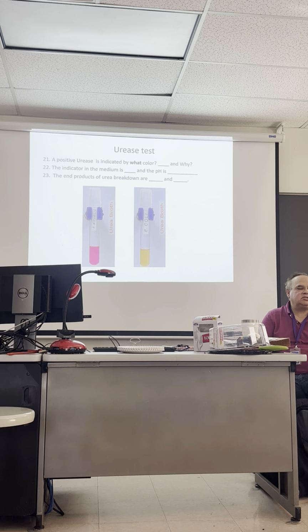Phenol red, in this capacity here, where it's fuchsia, it's basic. Here, it's neutral, okay? And when it's yellow, it's acidic. What color is the one with the cola? This one right here. No, that's over, fuchsia. No, what color is it? The yellow. What color is E. coli? E. coli would be yellow. Oh, in this test, it would be light pink.